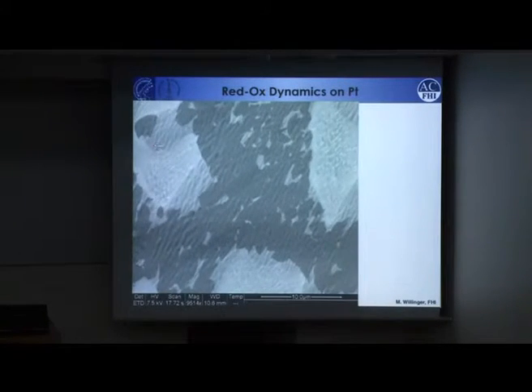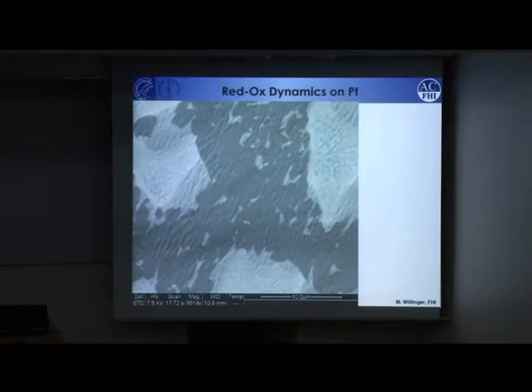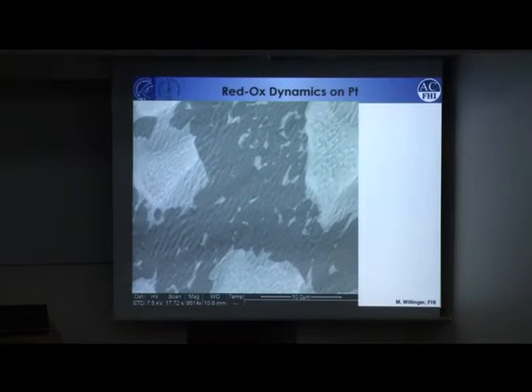And what you see here is graphene growing on these gray contrast regions, and in the brighter contrast regions, graphene is actually etched away. So you see also that the surface is differently reconstructed in different regions here. But basically, it's again platinum that is either oxygen or hydrocarbon covered, or which is metallic. The termination changes, and according to the termination of the platinum, the surface structure changes.